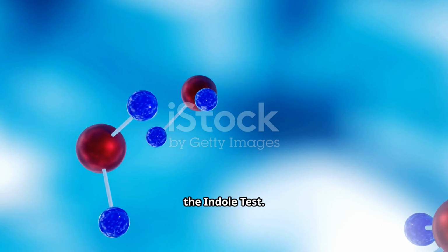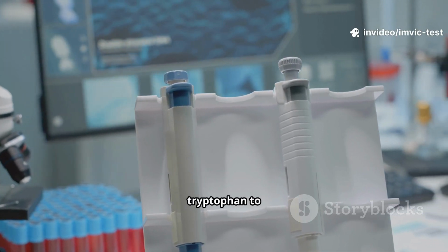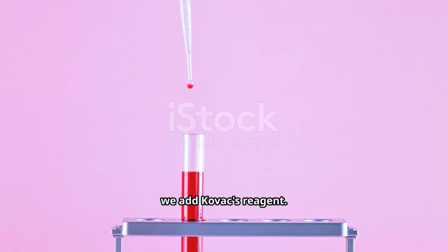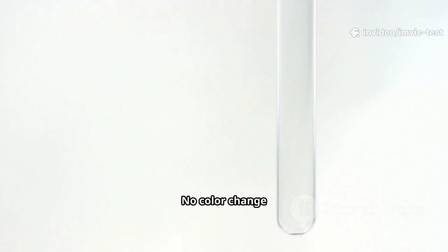Let's start with the Indole test. This test checks whether the organism can break down the amino acid tryptophan to produce indole. The medium used is tryptone broth. After incubation, we add Kovacs reagent. A red or pink ring on top indicates a positive result, meaning indole is produced, as in E. coli. No color change means negative, as in Enterobacter.